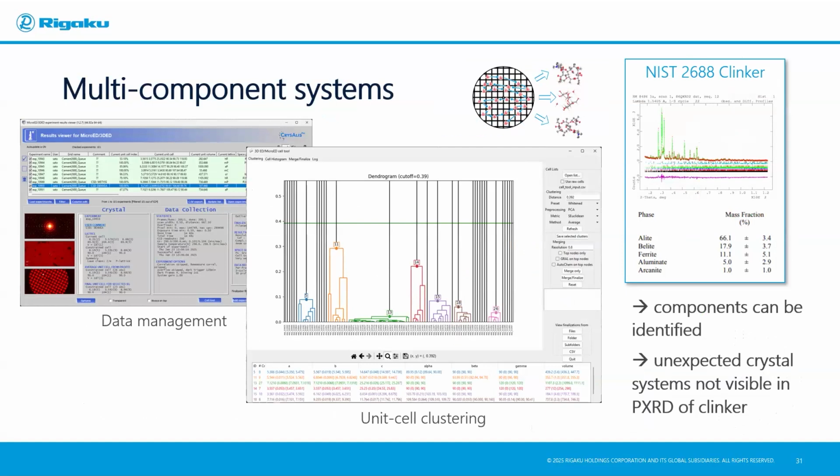It's very hard because you may have a bias, for example, in selecting the grains for grains that have a, let's say, well-defined or good-looking morphology and are in the right size bracket. Or you may have a bias because of varying crystallinity, and so on. So just counting how many grains you find from each type is not necessarily the way to go. Then you could factor in the volume of each individual grain that you found.